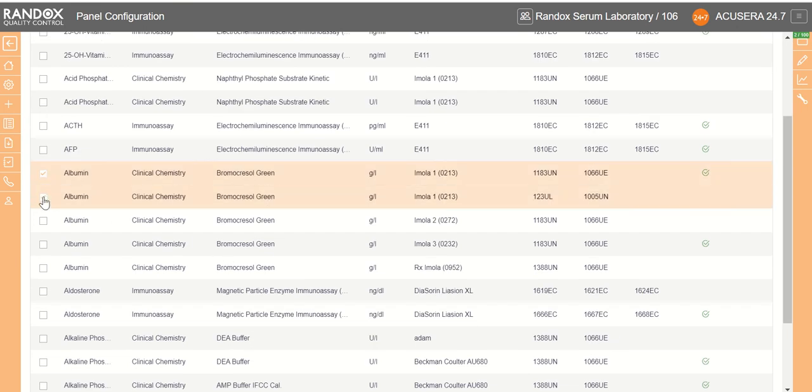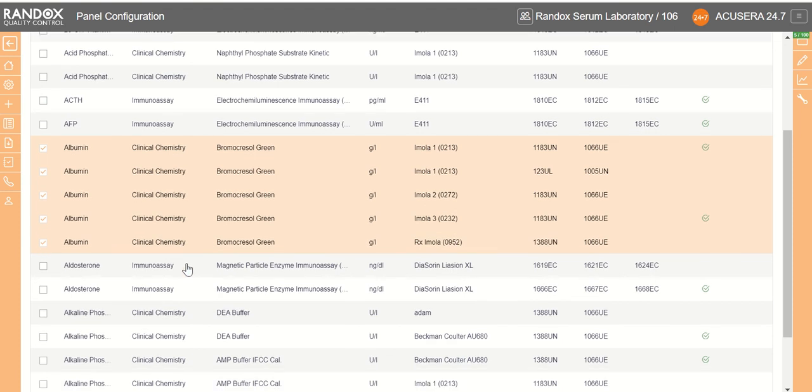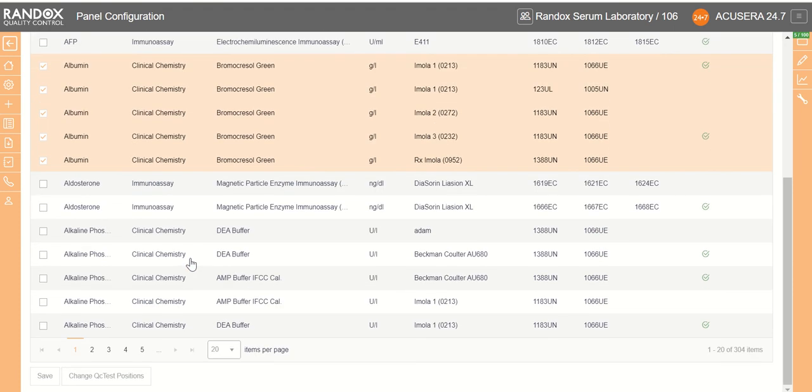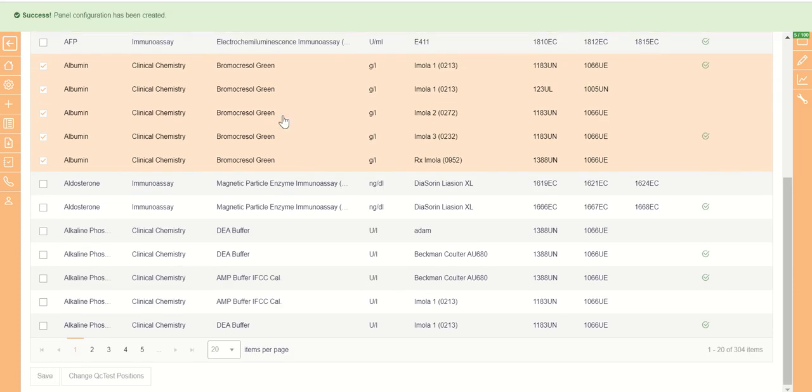So we select all of our elements, scroll down to the bottom of the page, and click save. That will create our new QC panel.